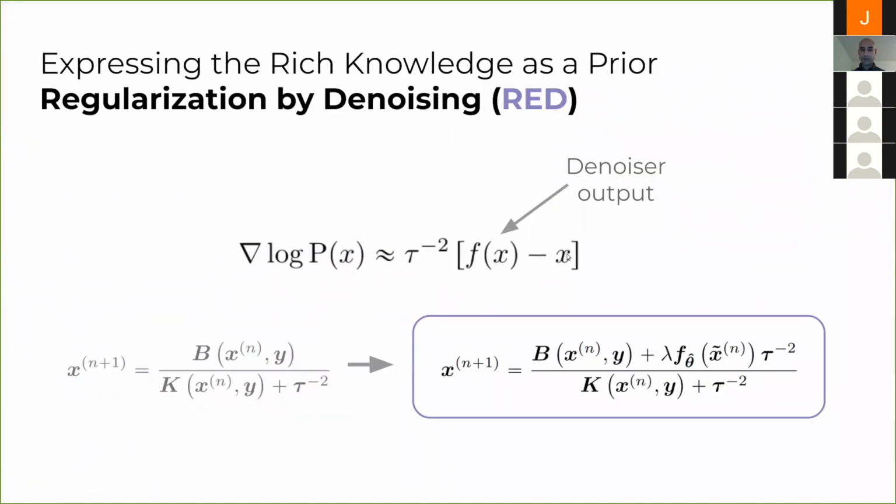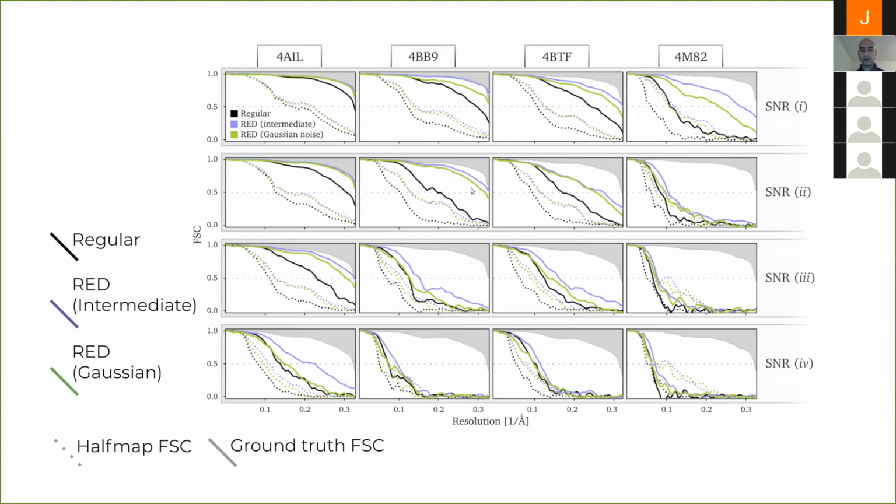So we gathered up all of those little reconstructions and we trained our neural network to go from those to the ground truth, the original volume that we used to generate all of these 2D images, and then subsequently the reconstructed 3D volumes. But we also did this other thing where we just took a 3D volume and applied Gaussian noise to it, and then trained a neural network denoiser to go from that noisy 3D volume to a perfect ground truth 3D volume. Hope that answered the question.